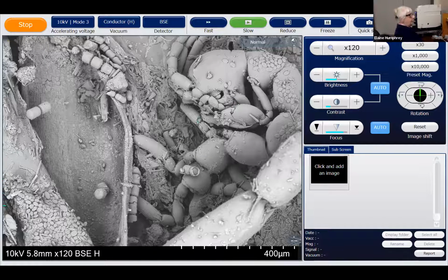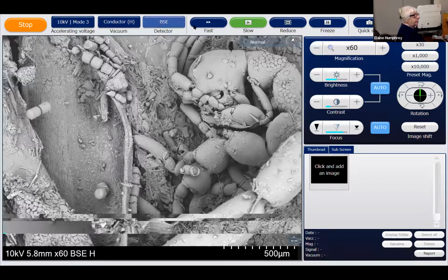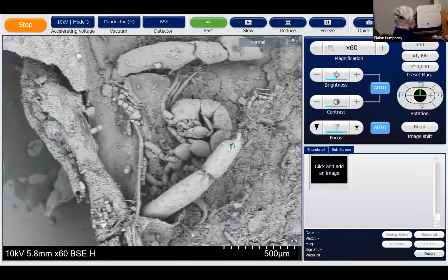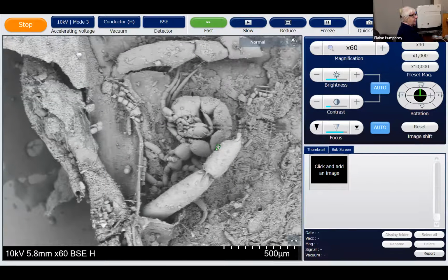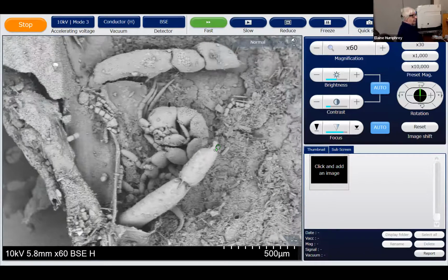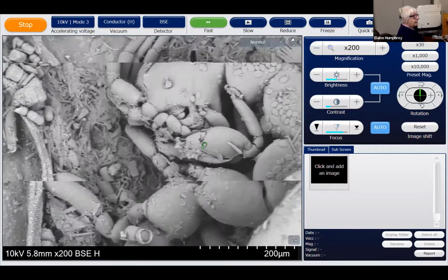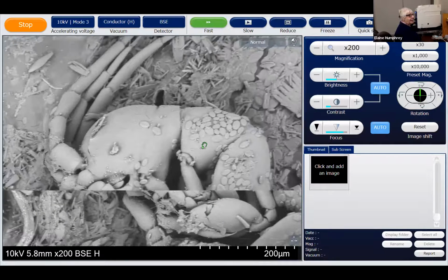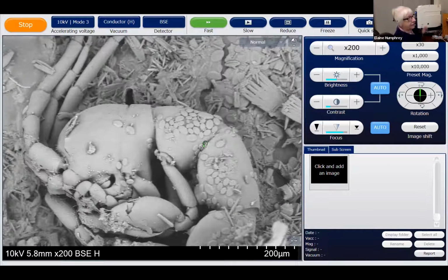So with this guy, let me take him down a wee bit. These are the antennae. You can see my cursor, yeah. And there's the head and there's the back and there's the legs sticking out. And there's claw legs and all kinds of legs. I'm going to put this bit in the middle. And we're going to have a look. On his back, you can see he's got a lot of cocconeis on him.